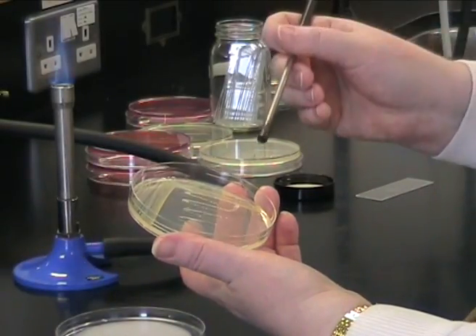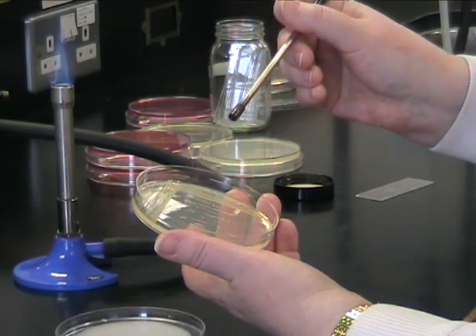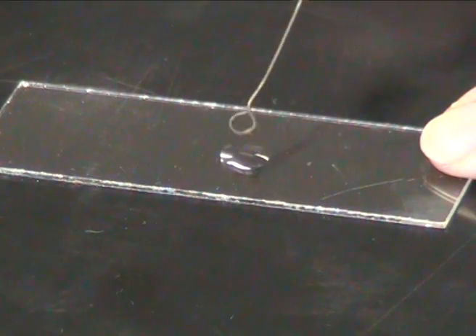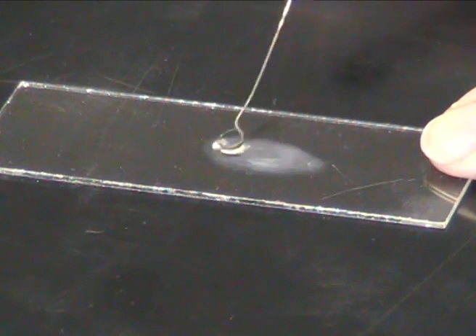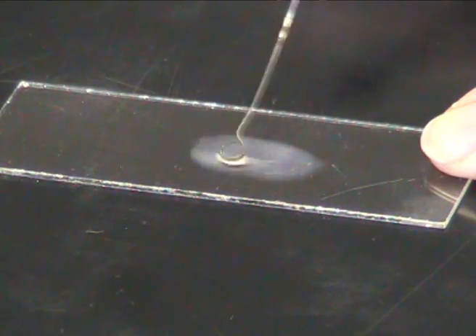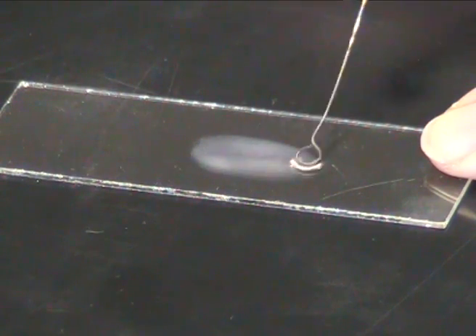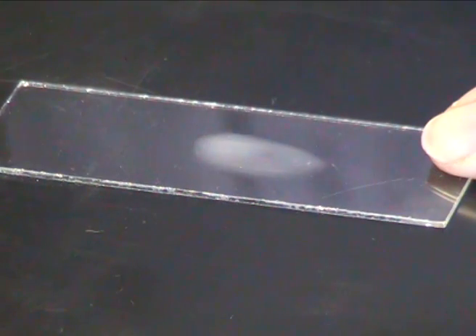Using a sterile loop, take an isolated colony from your plate. Emulsify your bacterial colony into the drop of water, being careful to spread it out quite thinly. You should still be able to see an opaque film of bacteria. When you've finished, flame your loop.